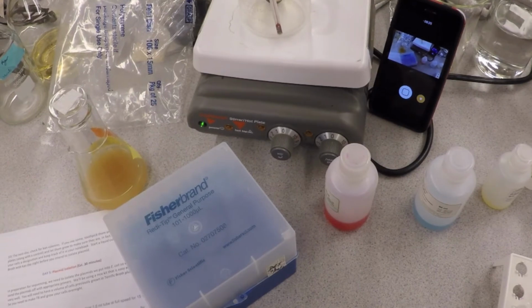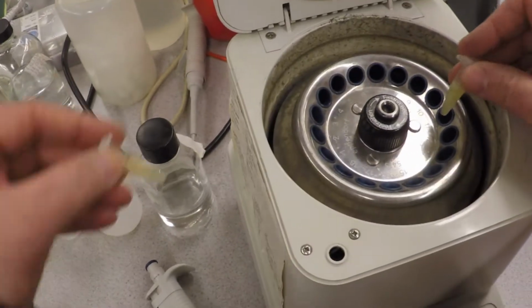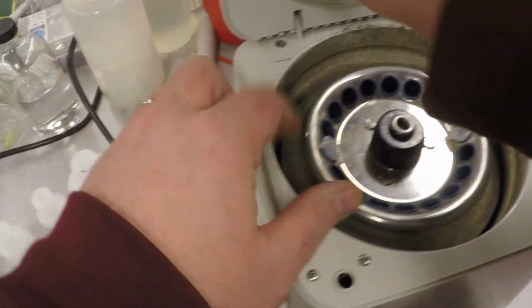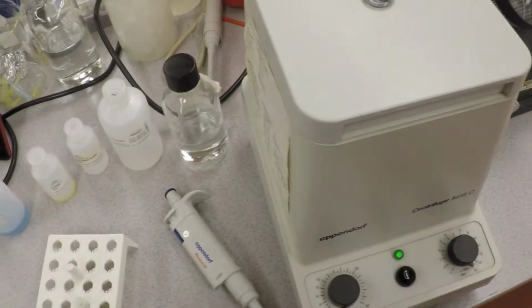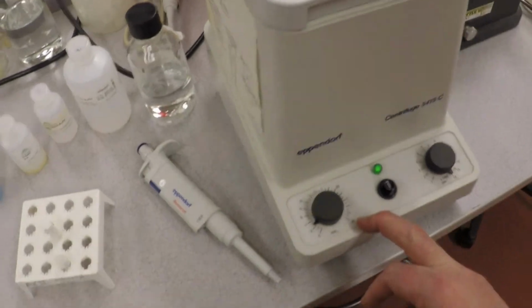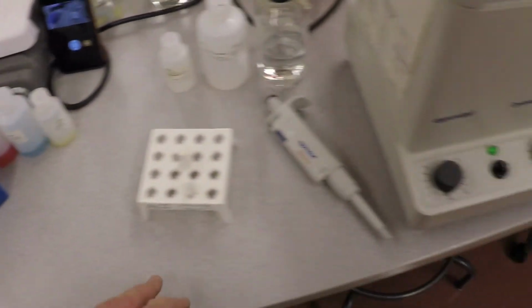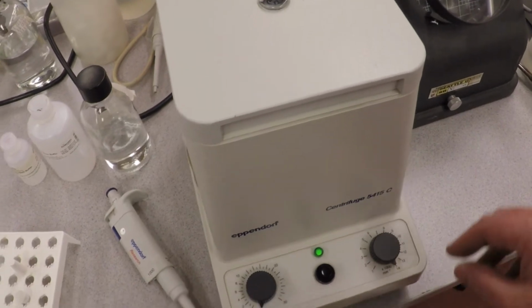Now, it says here centrifuge for 2 minutes, and that means at full tilt. So come back over here, balance everything. And we turn this thing on high speed for 2 minutes and let it go. Okay, she's coming down after our 2-minute run.